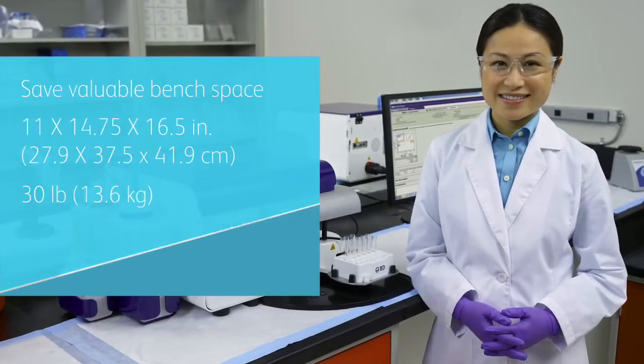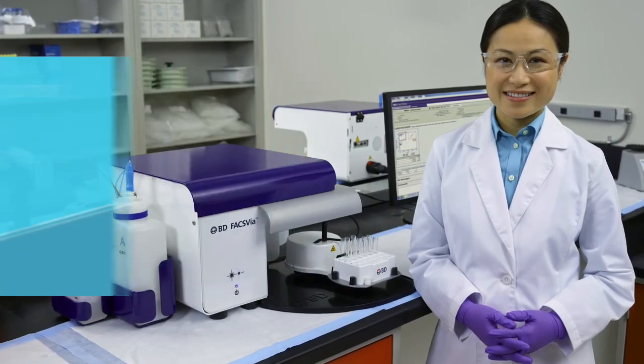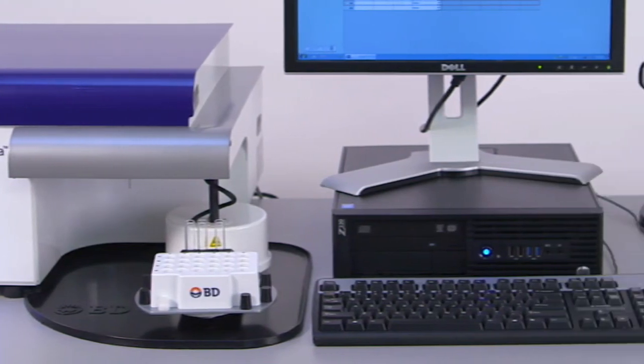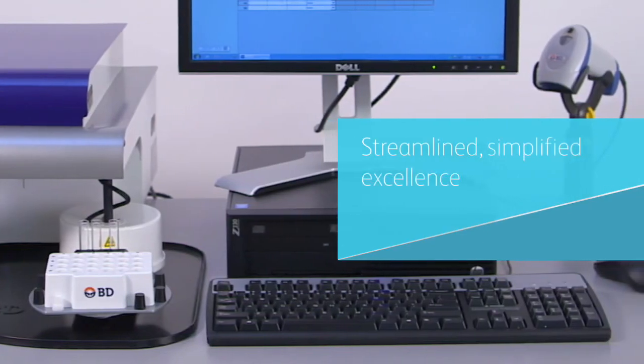This space-saving system offers a small footprint and fits easily on a benchtop. BDFAX VIA helps you meet your lab challenges with the performance of a full-function clinical flow cytometer in a small, cost-effective package — that's streamlined, simplified excellence.